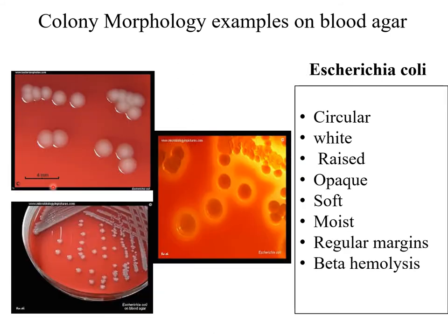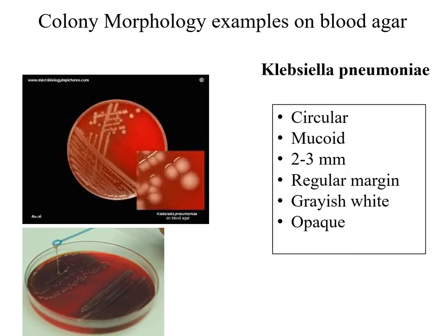This represents Escherichia coli. The colonies are circular and white in color. They are raised, opaque, soft, and moist, with regular margins. They are characterized by being beta-hemolytic on blood agar.